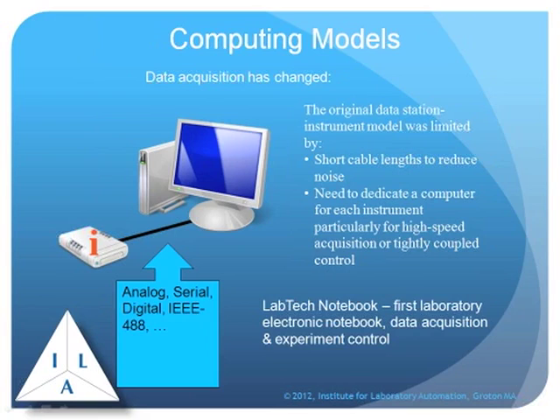In many cases, the systems came with the analysis software, but in some cases, it was up to the analyst to provide it, and that led to the development of the first electronic laboratory notebook by a company called LabTech. This was back in the 1980s when they came out with their system, and it was designed for doing data acquisition and experiment control, primarily using serial or RS-232 interfaces between the computer and the instrumentation. It was designed to allow somebody to set up all the communications protocols, execute the experiment, acquire the data, and process it.